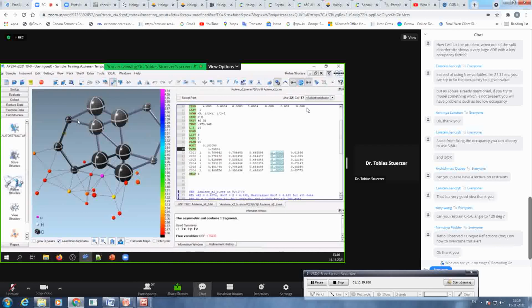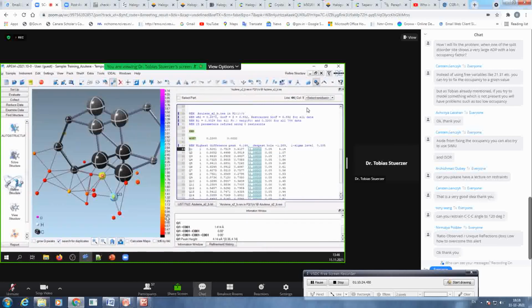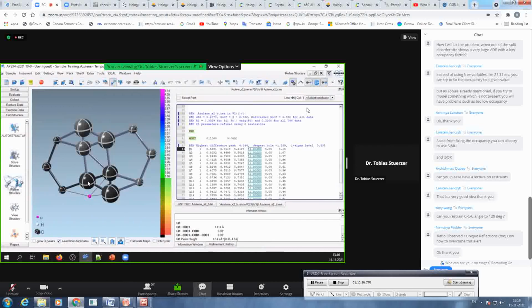These are smaller because there's more intensity, and these are bigger. So this is the last one here, this Q peak. These are bigger because there's only half the density. Yeah, and this I leave for you as a homework.